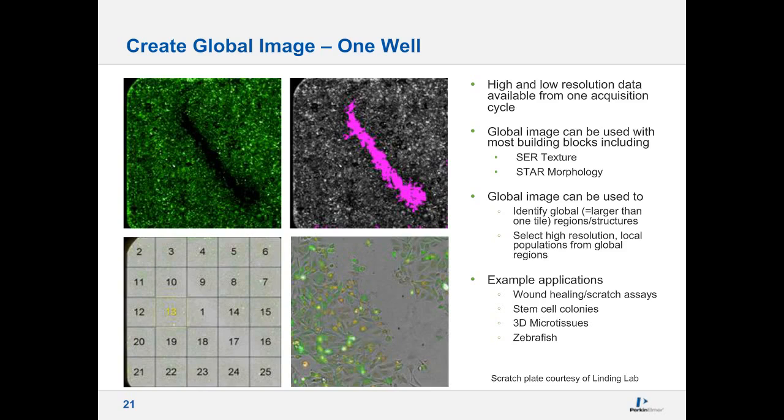Now, why would you want to do this? You could do the top left-hand corner image easily with a 5x magnification, but then you would not be able to analyze cells for subtle phenotypic changes, whereas in the 20x image, you would be able to pick up very subtle phenotypic changes, and you can then use Harmony to basically classify phenotypes in relation to their position to, for example, the wound boundary. This is a very useful tool for a wide variety of different applications.